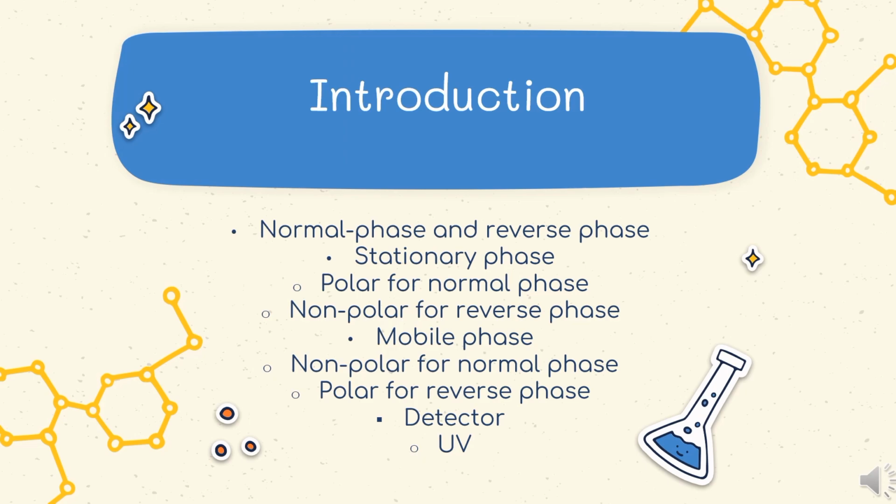In chemistry, biochemistry, and other related sciences, high-performance liquid chromatography (HPLC) is an effective analytical technique that is frequently used. A mixture of compounds is separated based on their unique physical and chemical characteristics, such as size, charge, and polarity. Different chemicals in a mixture will react differently with the stationary phase and the mobile phase according to the fundamental element of HPLC. The mobile phase normally passes through a column that has been filled with stationary phase. Based on how they interact with the stationary phase, the various components of the mixture will be separated as the mobile phase passes through the column.